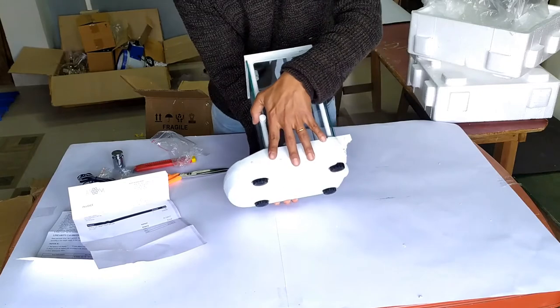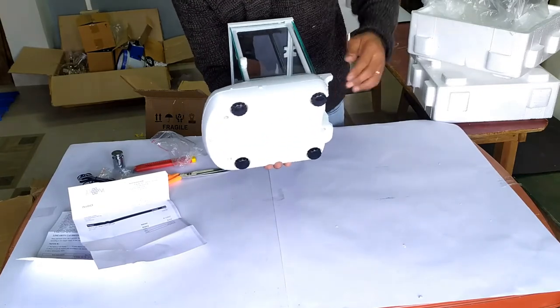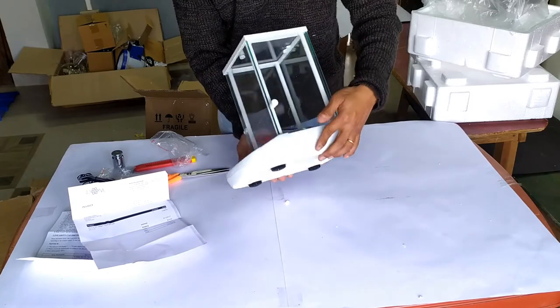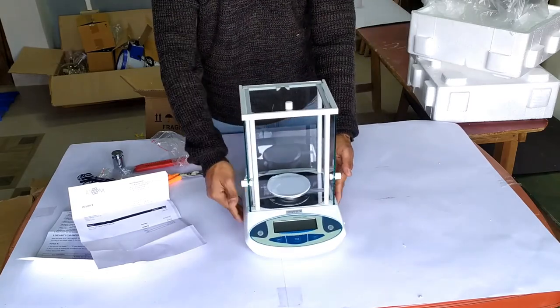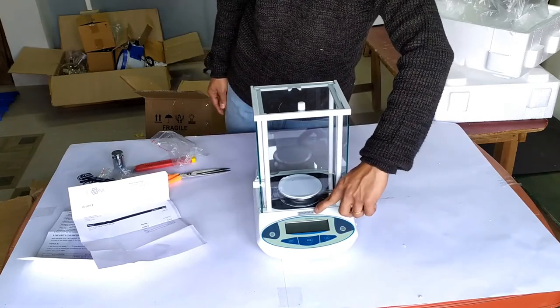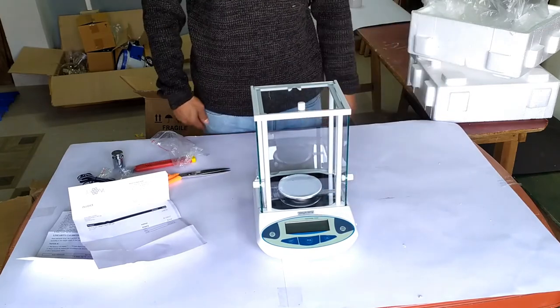These four screws are used to level the balance in a perfectly horizontal plane. You can also see the maximum and minimum holding capacities printed on the front right above the LCD screen.